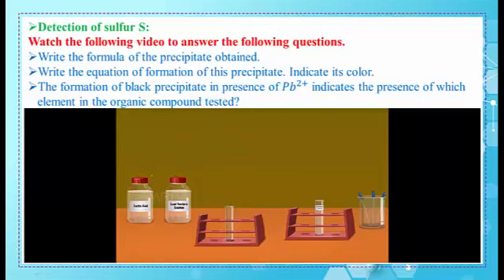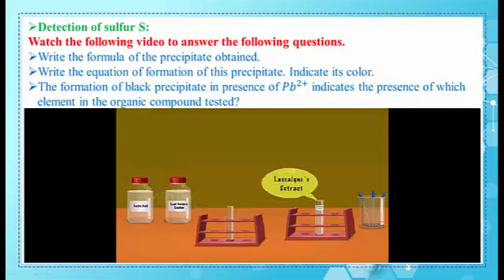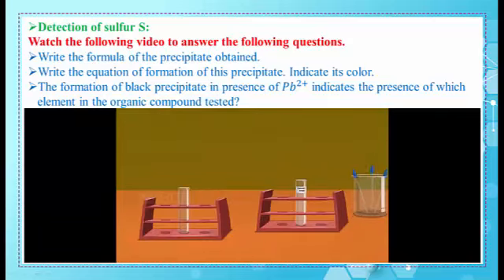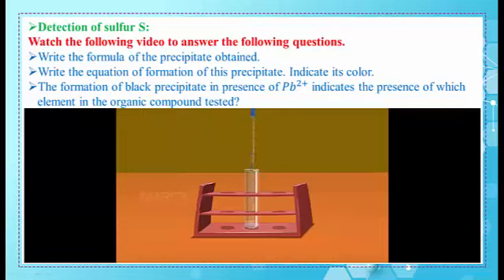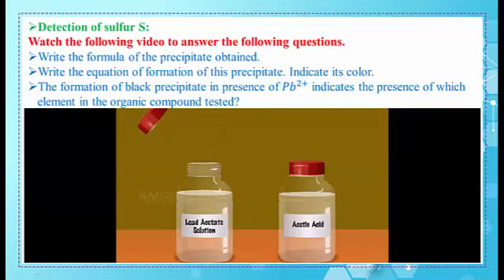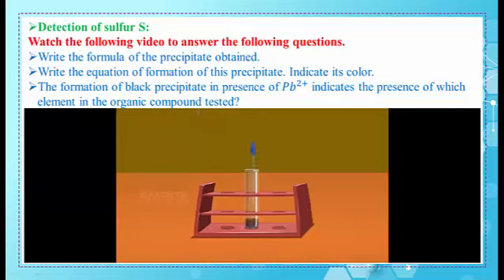For sulfur detection, we require: acetic acid, lead acetate solution, test tube, Lassaigne's extract, and droppers. Take a small amount of Lassaigne's extract using a dropper and pour it into a clean test tube. Using another dropper, take a small quantity of acetic acid and add it into the test tube containing Lassaigne's extract. Take a small amount of lead acetate solution using another dropper and add a few drops into the contents of the test tube. Sodium sulfide formed during the preparation of Lassaigne's extract reacts with lead acetate and forms a black precipitate of lead sulfide.